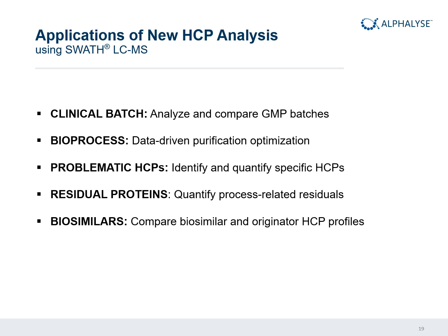It's also very easy to compare biosimilar versus originator. As long as you can get hold of the originator, we can run the originator next to the biosimilar and show similarities and differences. And finally, we have also used the method to validate ELISA by looking at the coverage analysis. So instead of running 2D-gels and Western blotting, we can do the analysis of ELISA by using mass spec. So again, you get a list of proteins recognized by your ELISA and not just spots on a 2D-gel.